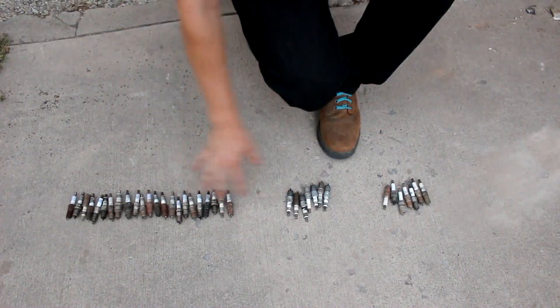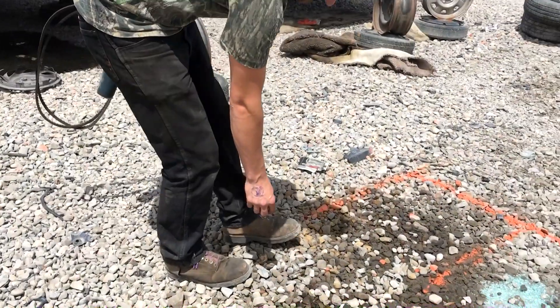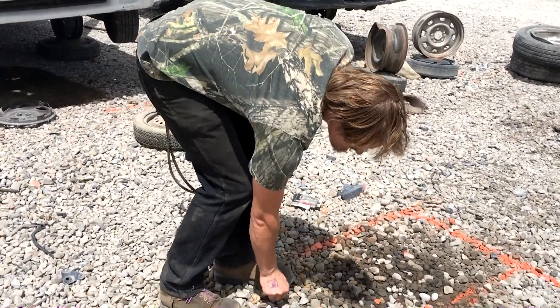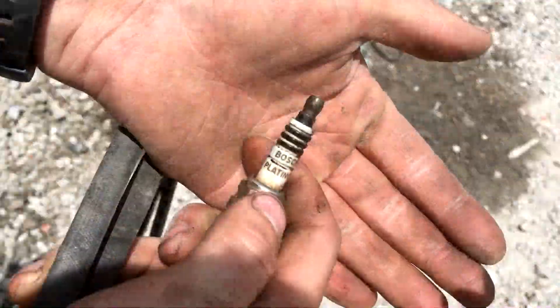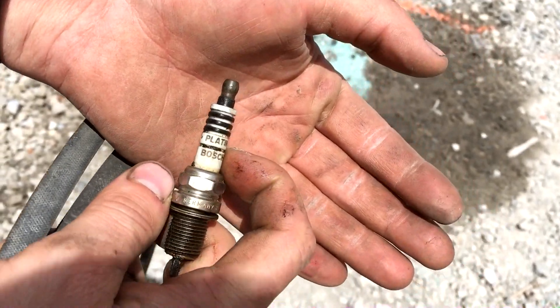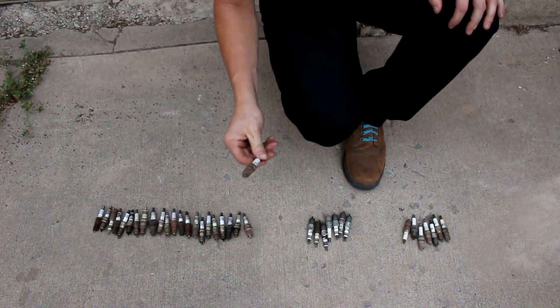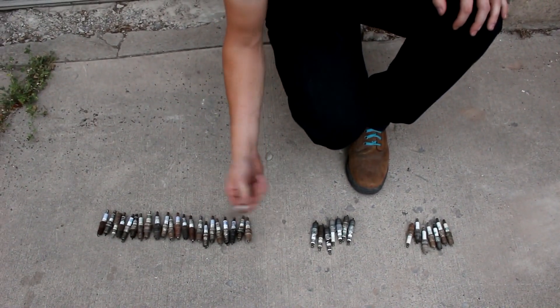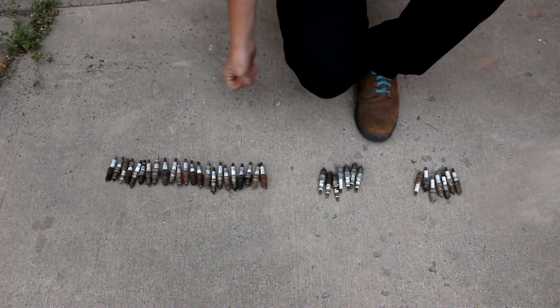Hi everyone, welcome back to Cody's Lab. Today I'm going to be trying to extract platinum from spark plugs. I have a whole bunch of spark plugs here that I've collected from junkyards. Spark plugs are laying around the junkyard all the time because people take them out of the engine block to look inside the cylinder to see how well the engine was running before they purchase it. Usually the spark plugs end up on the ground and eventually get thrown away, so while I'm walking around the junkyard I occasionally pick up a few.